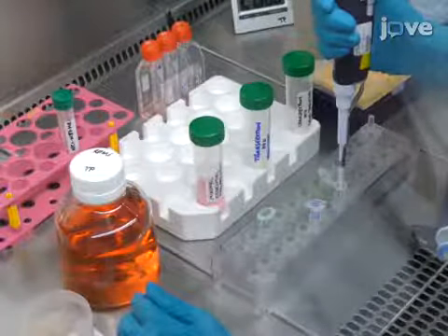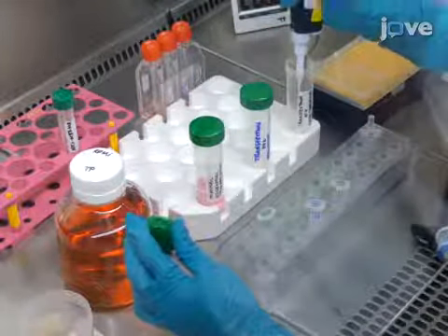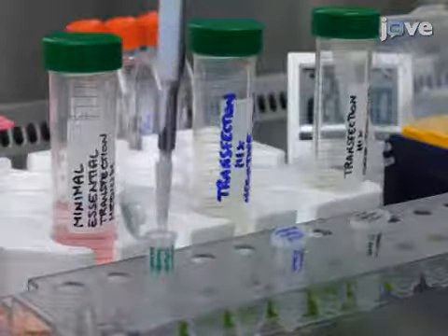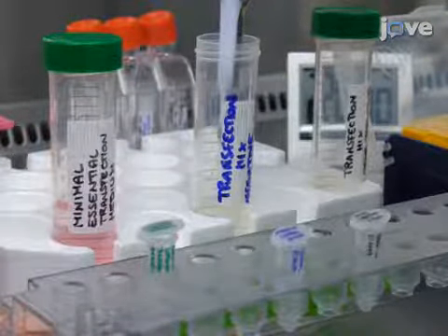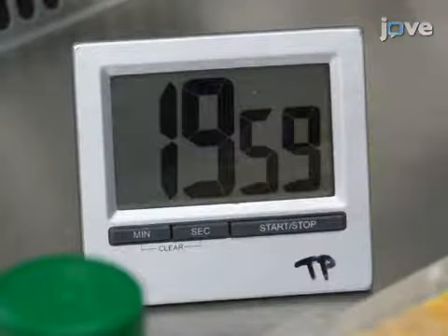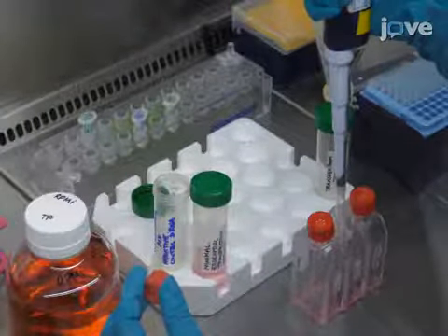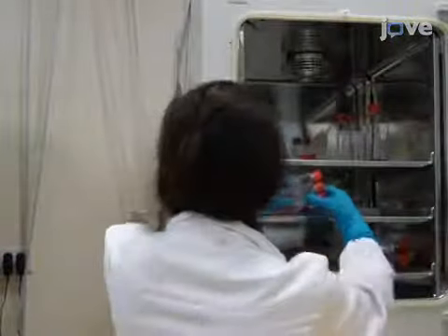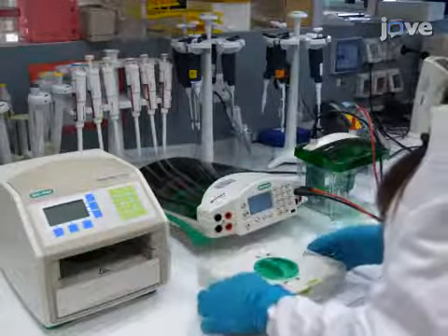Next, dilute 12.5 microliters of each gene-targeting siRNA oligonucleotide or negative control siRNA oligonucleotide in minimal essential transfection medium. Add a cationic liposome transfection reagent at a 1-to-1 ratio with the oligonucleotides. Incubate at room temperature for 20 minutes. After this, add 700 microliters of the transfection mix to each T25 flask. Incubate at 37 degrees Celsius for 1 to 3 days. Then use RT-PCR and Western blot analysis to verify gene knockdown.